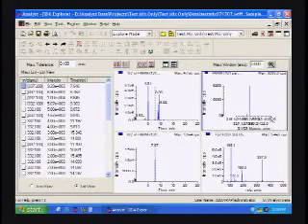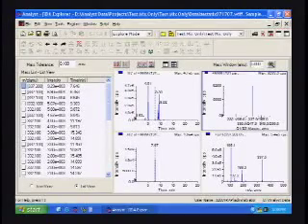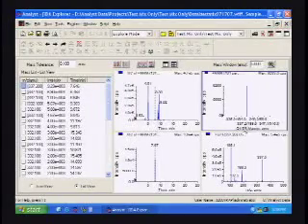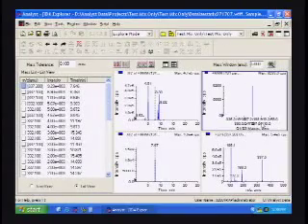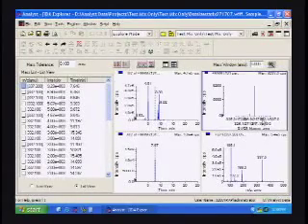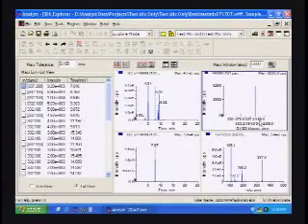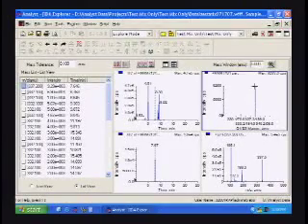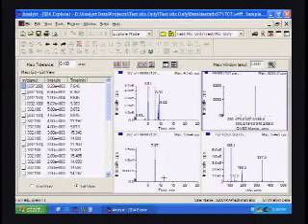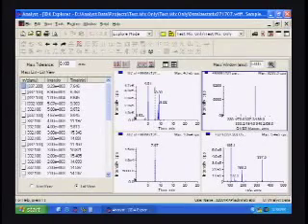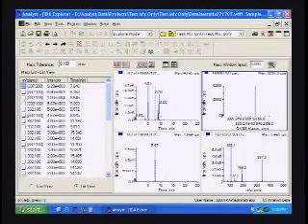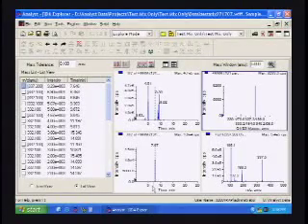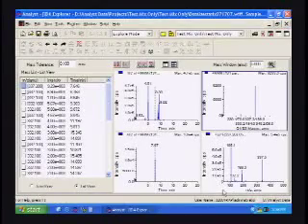You can see, if I zoom in real close—you can see 337.2 to 188, and there's a big blue line here which corresponds to fentanyl. This dotted line represents where this time slice is, so this MRM time slice is this dotted line, and it's also represented by the dotted line here.